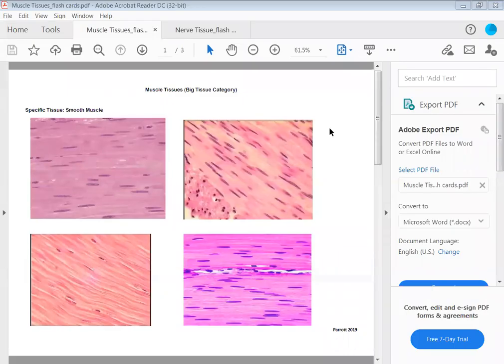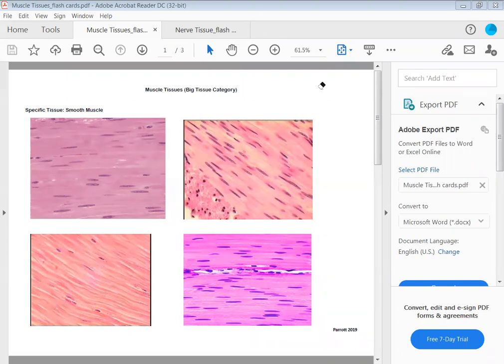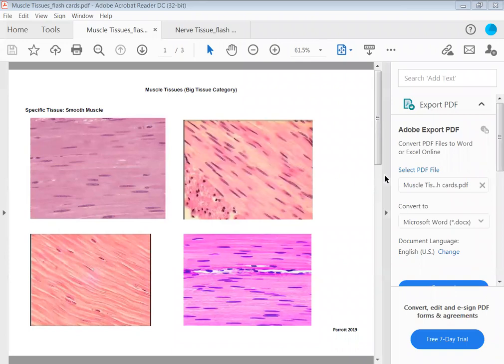Let's discuss muscle tissues and nerve tissues. The first one is smooth muscle. In smooth muscle, most of the time it's slightly out of focus — it looks a little fuzzy. This would be an awesome representation of what you would see on the practical. You can't see one muscle fiber from the other; it's really blurry. That clues you in that this is smooth muscle tissue. The big tissue category is muscle tissue, and the specific tissue is smooth muscle. The only things you have to identify are the black structures, which are the nuclei.